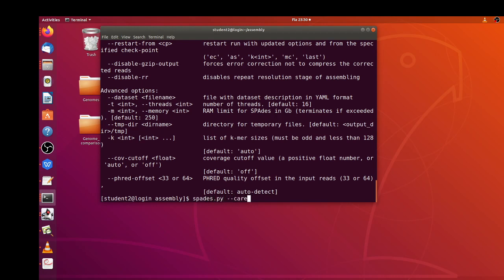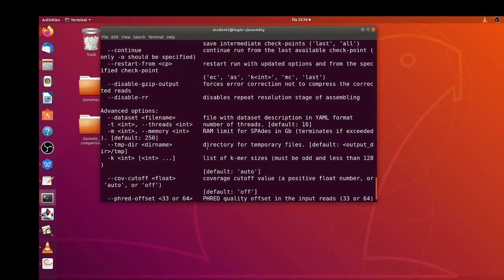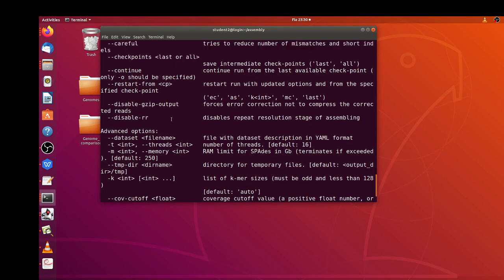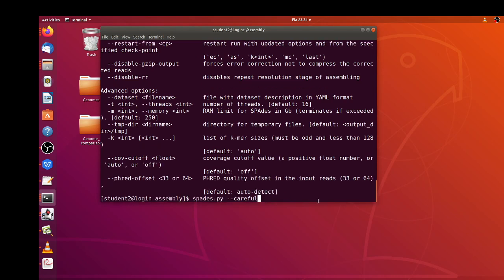This particular option here, careful, allows SPAdes to run by reducing the number of mismatches and short indels. That's what this option does. So let's specify the output: -o and then let's say spades_out. SPAdes after doing the de novo assembly will store or save all the results in this particular directory.